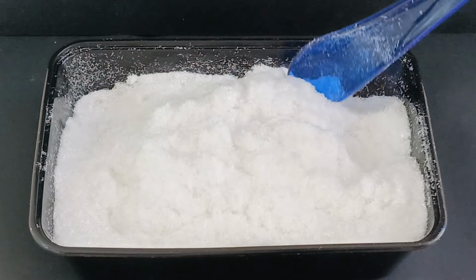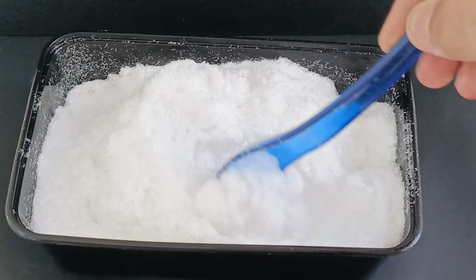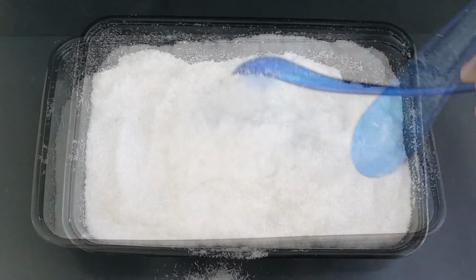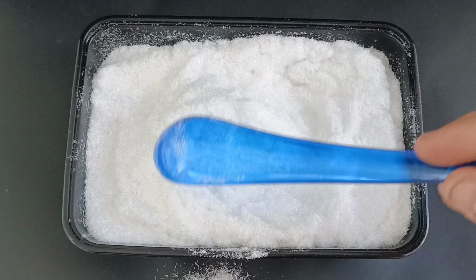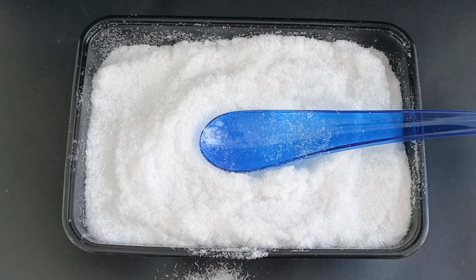And before you say that the salicylic acid is probably still wet, and that's why my yield is so high, I actually made sure it was dry by leaving it under the sun for a long time and frequently measuring its weight. The weight kept decreasing by around 1 gram per minute, and that was just the water evaporating off. At a certain point, the mass stopped decreasing. That meant that the salicylic acid was fully dry.